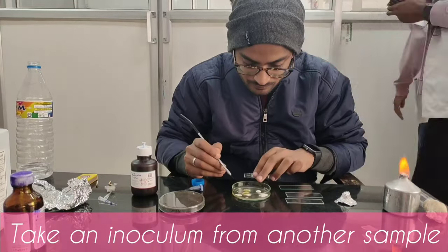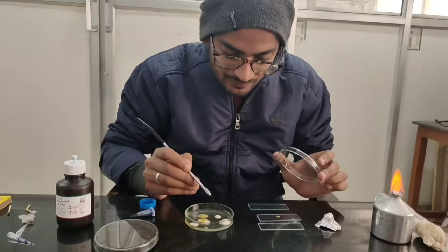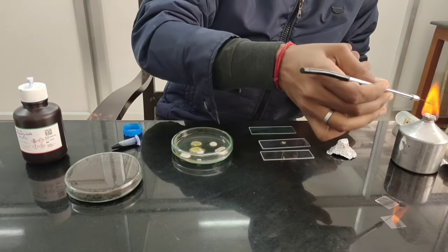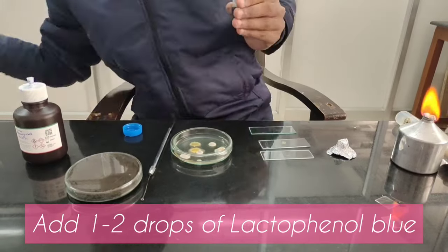We add one drop of distilled water and spread the inoculum. I have another petri plate with different fungus — a yellow fungus and a white fungus — and then we made a smear.